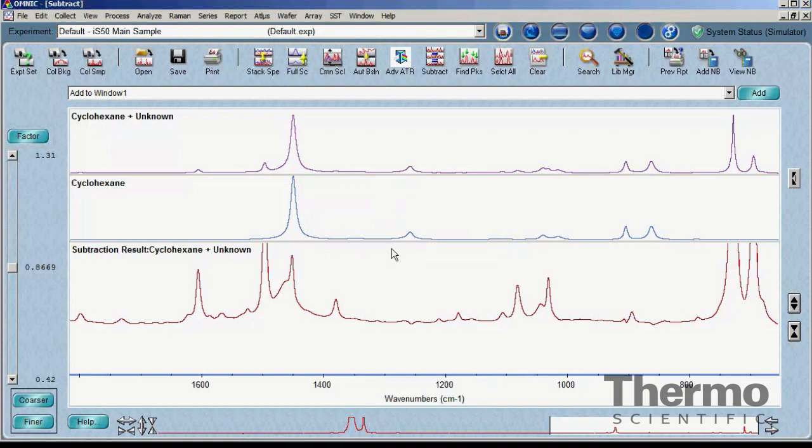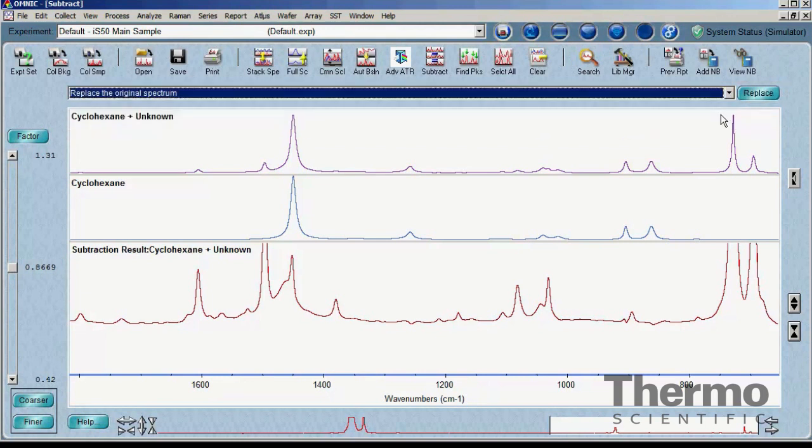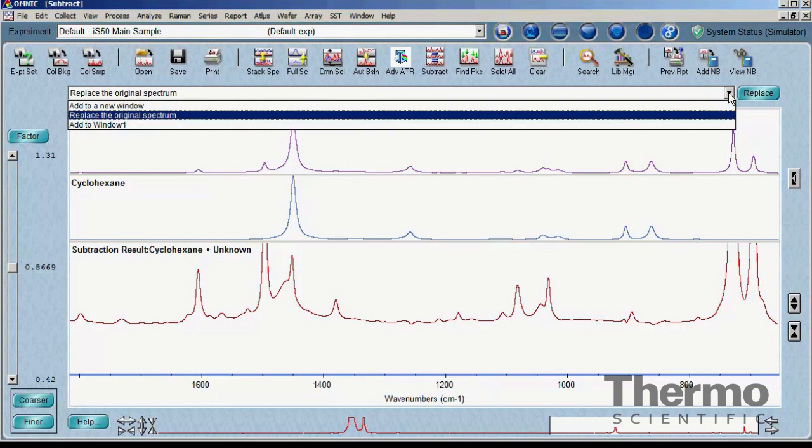To complete the subtraction and save the result into an Omnic spectral window, use the button found to the right of the title bar, just above the top spectral frame. This button will either display the words add or replace, depending on the desired result. This can be changed by dropping down the list on the title bar and selecting the needed result. It is not recommended to replace the original mixture spectrum unless it has been saved so it can be recalled if needed.